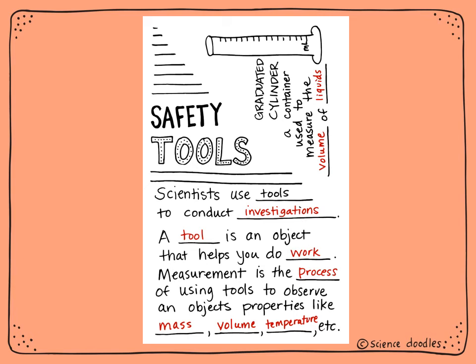Also on the top right hand corner you can see that they squeezed graduated cylinder onto this page as well. And it is a container used to measure the volume of liquids. So we're going to see how much space those liquids take up.